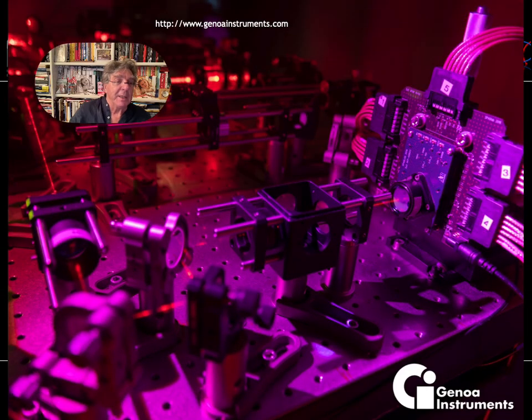This is what we decided to bring into our developed microscope. This is a startup here in Genoa, and it's called Genoa Instruments. Now, from this point, we can move to see what we would like to insert in this microscope that we built by ourselves, and today is already a commercial product called Prism.